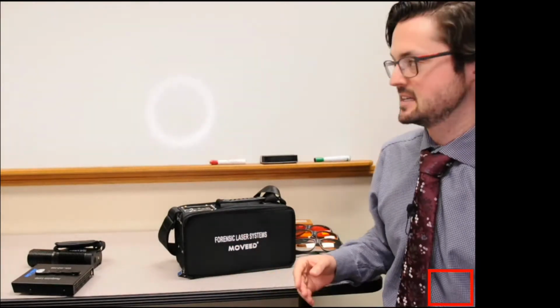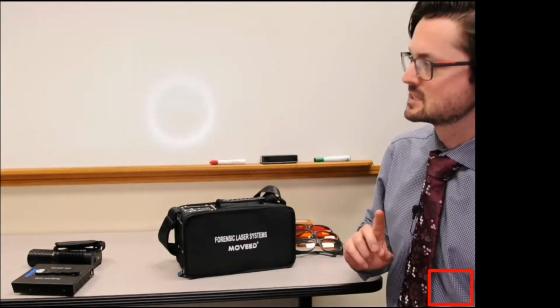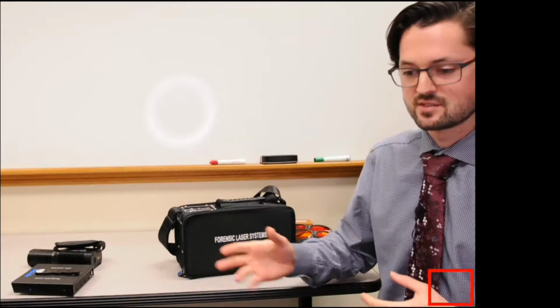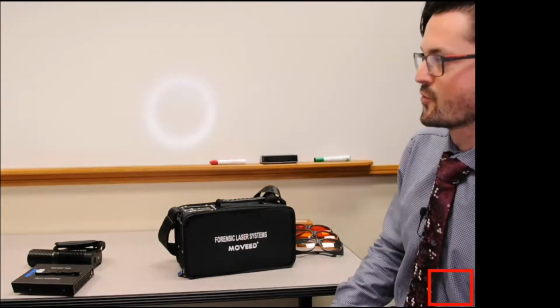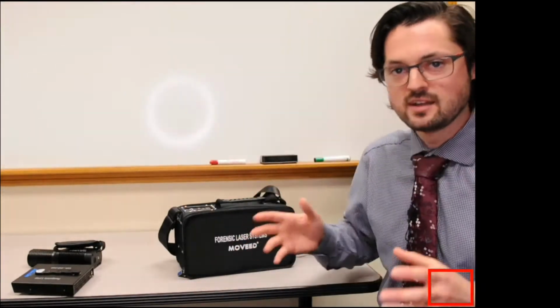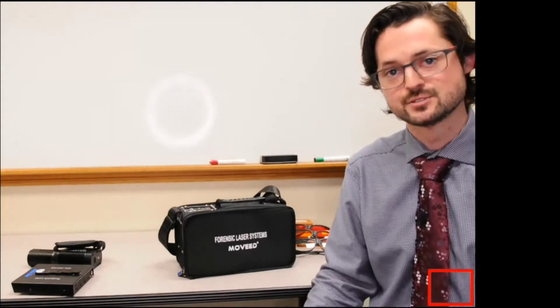lines in it. It's got a green excitation at 530, I think I wrote down 532 nanometers. It's got a blue excitation at 445 nanometers. And then it also has this, they're calling it like a cyan excitation. And that's going to be at 455 to 510. And so what you'll kind of see is these excitations are right in that region for causing fluorescence excitation of a lot of biological stains.